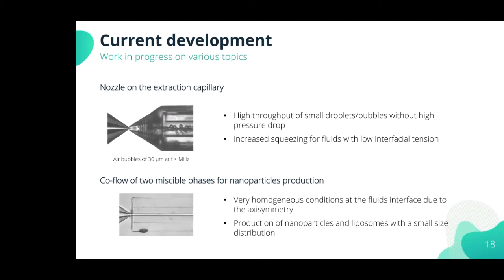And temperature, we have data with a temperature of 100 degrees. So yes, it can reach this temperature. Maybe higher, but we have no indication. We have no data, but what we know is that the epoxy glue will not resist above 300 degrees, and the nozzle also. So maybe it's a good idea not to go above 100 degrees.